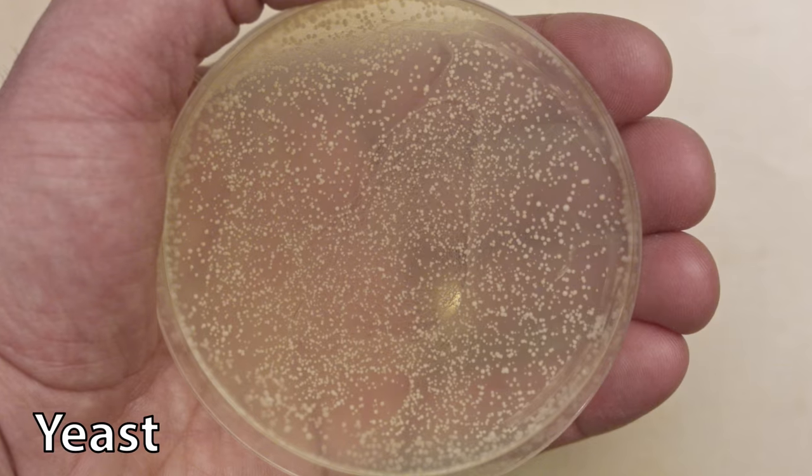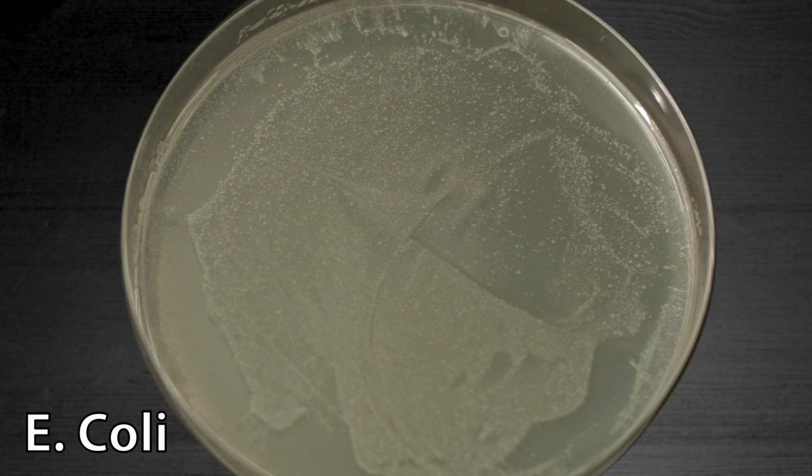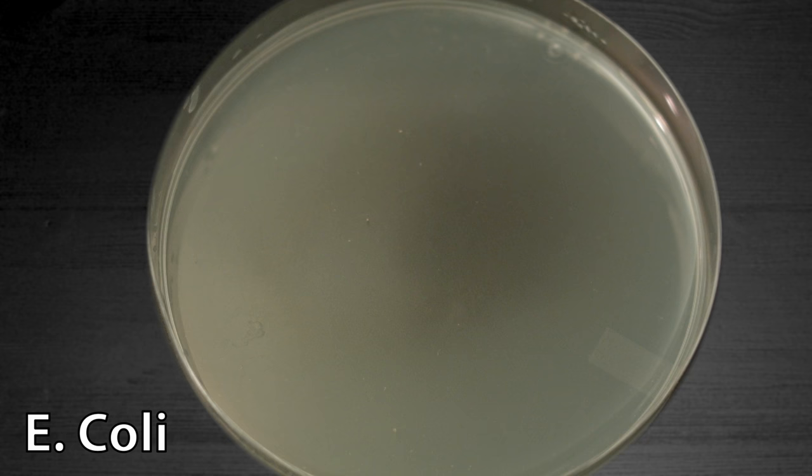Success! For the most part. The E. coli experiment went well. Out of the 4 plates I incubated, only 1 had no growth.